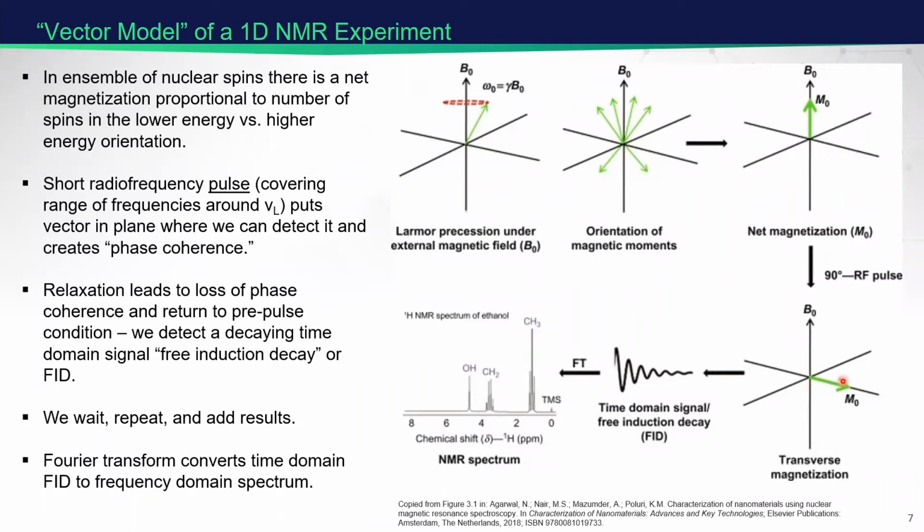To probe NMR, we apply a radio frequency pulse that's resonant with these nuclei, in that low frequency range. We apply this field 90 degrees to the static field, which causes all these spins to precess about that field. They absorb the energy, go through transitions, and now we have a net magnetization vector transverse, or 90 degrees, to the applied field. These spins are all precessing around that field, so they're coherent.